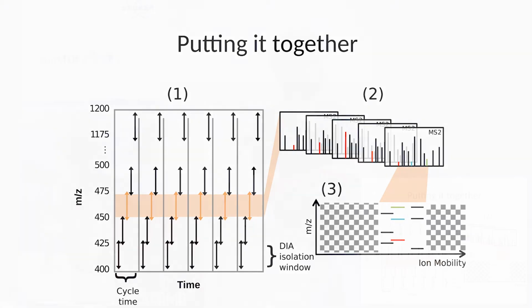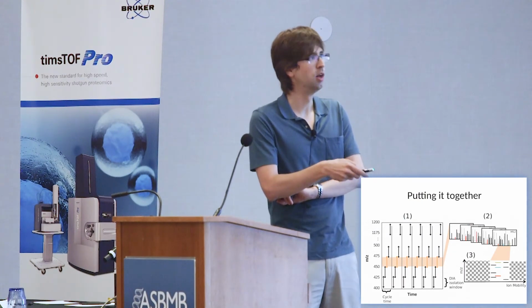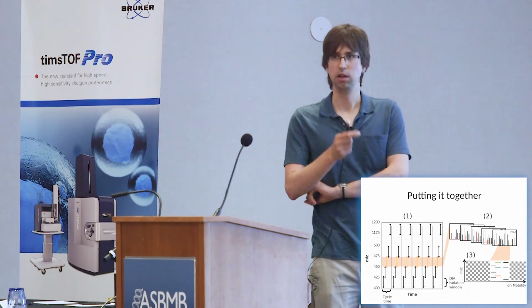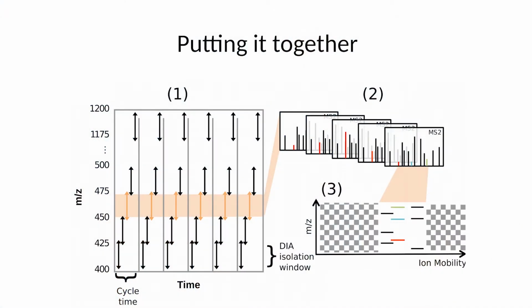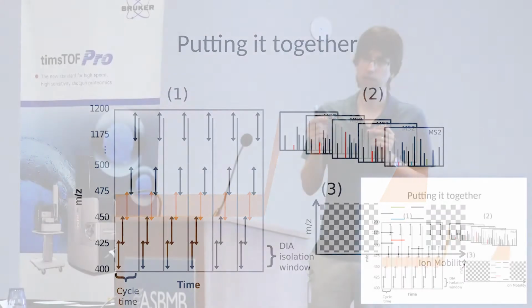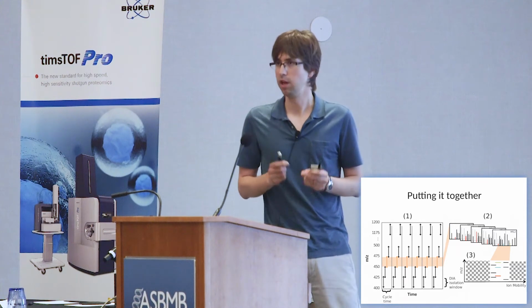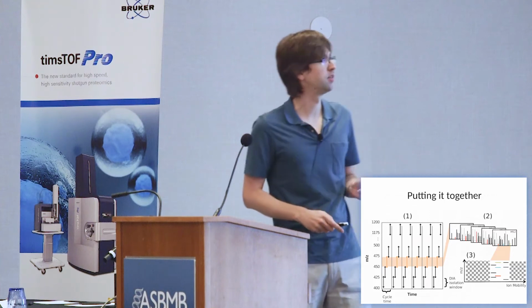And what you will notice now is that all the fragment ions from our peptide of interest, here in color, are lined up at the precursor ion mobility elution time. And these interfering black peptides that also produce interfering black fragment ions are now separated from the peptide of interest. So this addresses the first issue of linking precursor and fragment ions again in highly multiplexed MS-MS spectra. That's the first thing we noticed here.